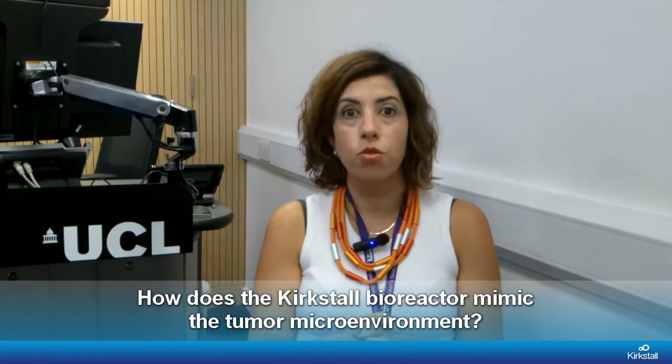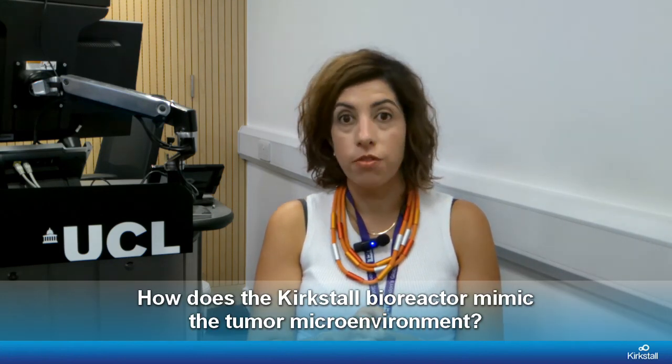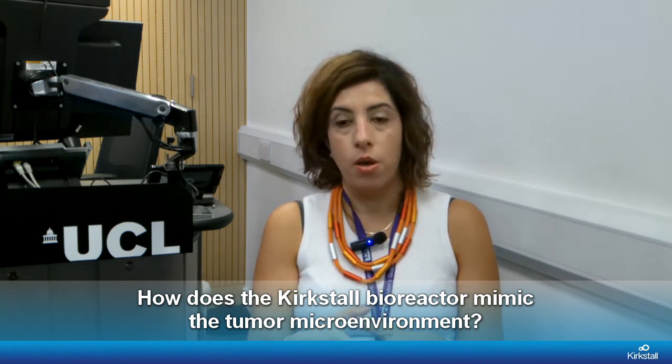Okay, I'm a bioengineer, and within my research group, we are using bioreactors, biomaterials and their combination to study how different biological systems grow in the lab, grow in vitro, how they interact with each other, as well as with our environment. Within that frame, we are particularly focused on tissue engineering, wherein we fabricate scaffolds with different biomaterials, both synthetic and non-synthetic, and we load those scaffolds, if you like, with different cell types of the tissue environment.